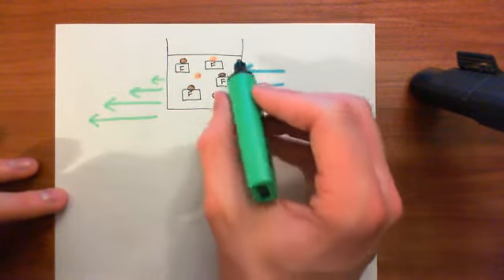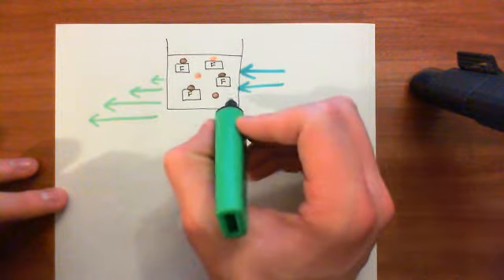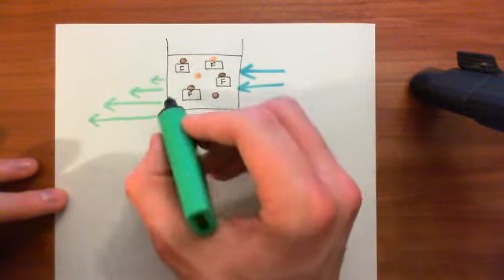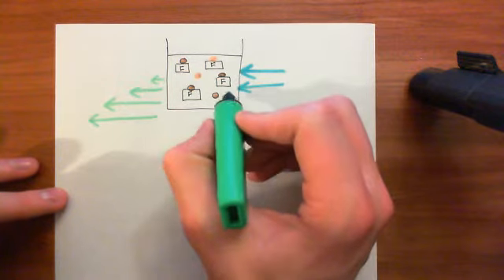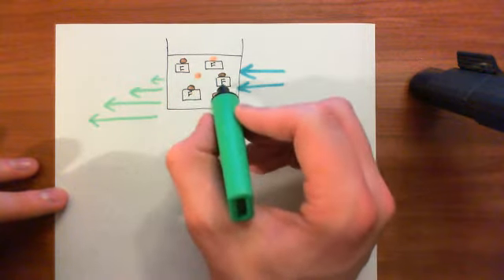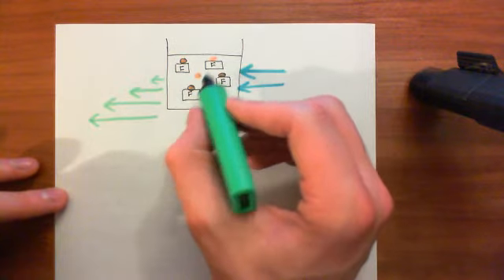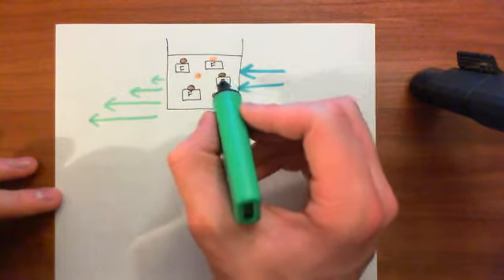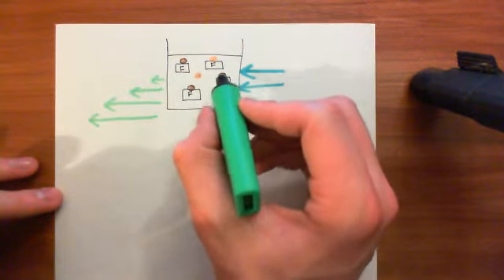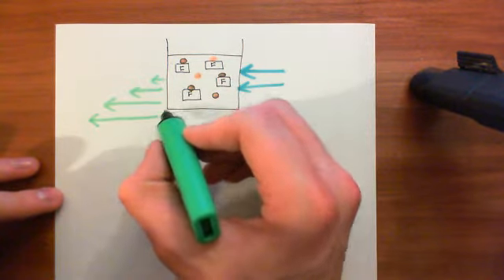We're in the meaningful portion basically, because if calcium concentration was too high, all of the Fluo-4 molecules would be bound to calcium all of the time, and then increasing calcium further wouldn't change the fluorescence. So that doesn't give us any information that would allow us to work out calcium concentration from the fluorescent signal.